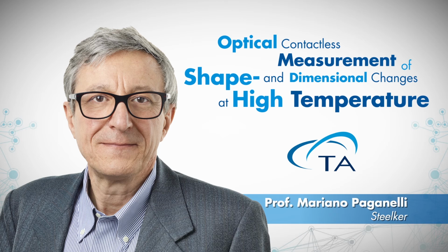And Harald is asking, what is the repeatability of the temperature measurement for accurate CTE calculation? Well, we usually evaluate the repeatability not on temperature but on CTE, given that the measurement of temperature is accurate by the thermocouple. The variation may be given by the measuring system on the thermal expansion. We normally are within the standard range for mechanical dilatometer. As we have seen in the slide for the repeatability of the accuracy of the measurement, we are at 0.03 times 10 to the minus 6.